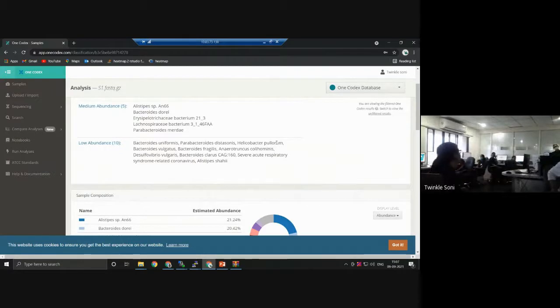Why exactly? Because for AMR, we have small strands of resistance genes which are to be amplified. On the basis of those small strands, it's showing us the abundance. Those small strands aren't even 16S. They are basically antimicrobial resistance genes. So according to that, it's showing the abundance, but it's not the correct metagenomic analysis which we can do. You can add your 16S sample over here, so that will for sure give you the correct abundance analysis.